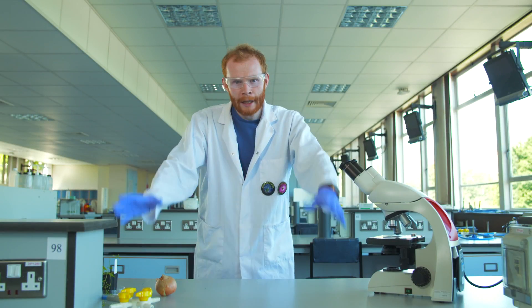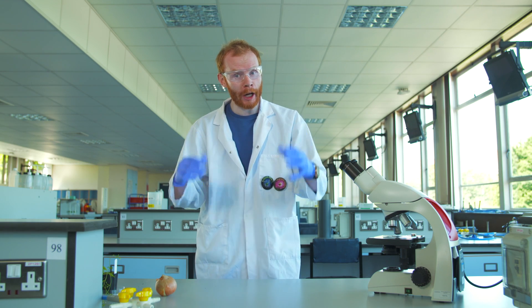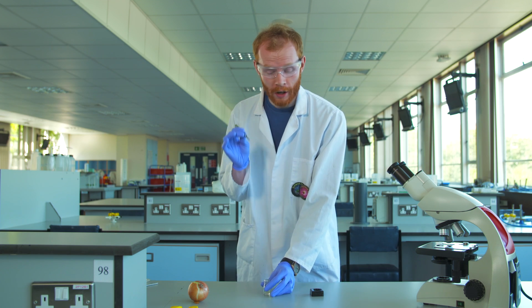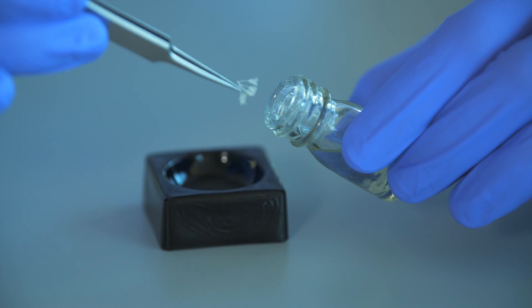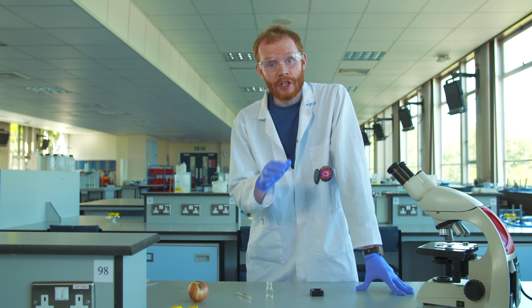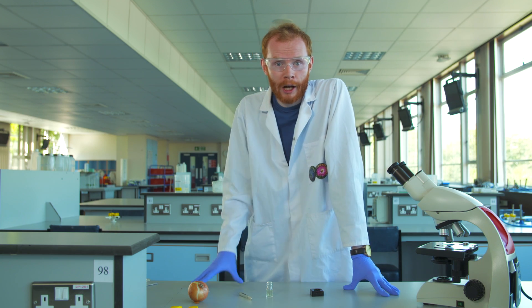Safety first. I've got my lab coat on, safety specs, and nitrile gloves. Here I've got some Arabidopsis flower buds that I fixed earlier in three parts ethanol to one part acetic acid. Using a pair of fine forceps I'm going to transfer some fixed buds into an enzyme solution, which is going to help digest that cellulose cell wall surrounding our plant cells.